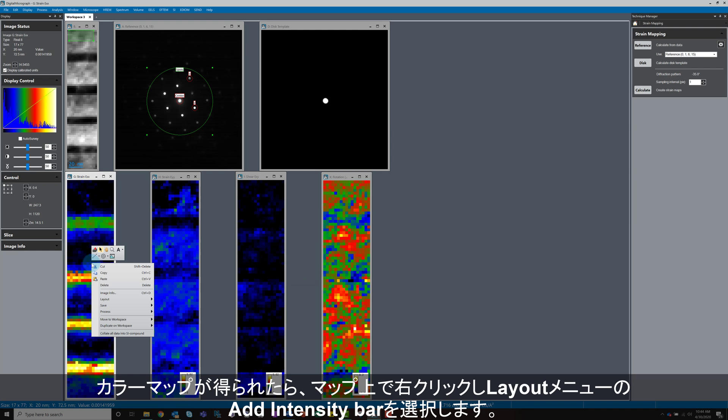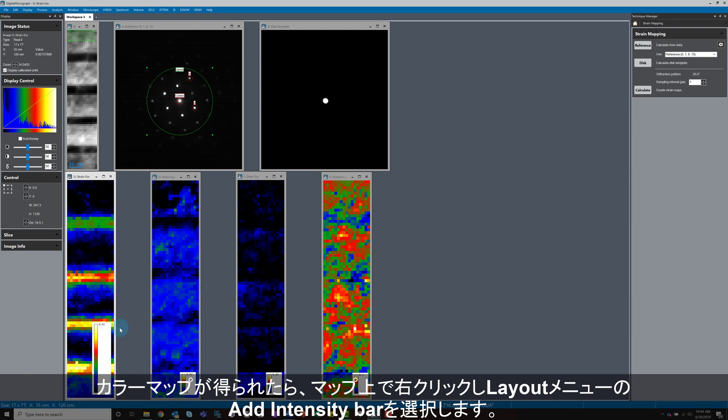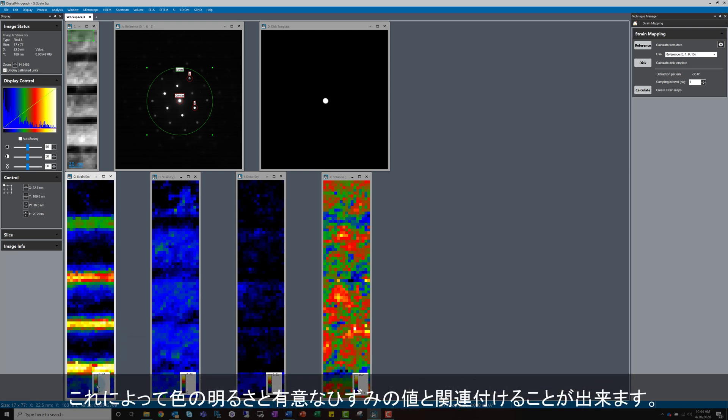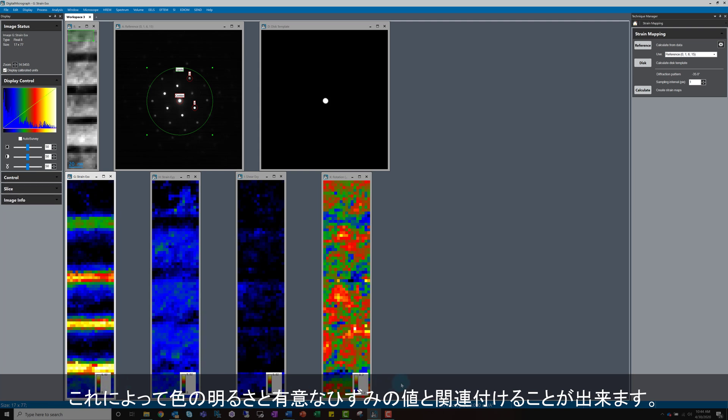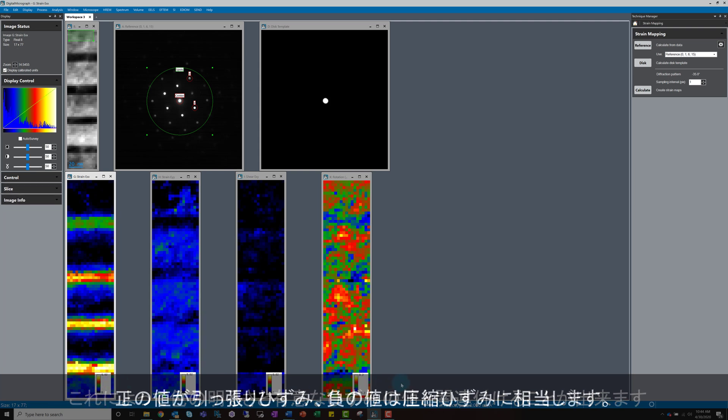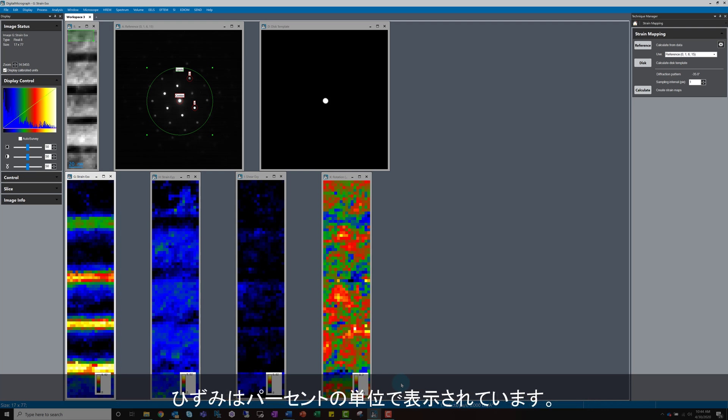Once you have the colour maps, intensity bars can be added by right-clicking, navigating to the layout menu and clicking add intensity bar. This is a useful way to link the colour intensity to a meaningful strain value. Positive values correspond to tensile strain, negative values correspond to compressive strain. Strain is dimensionless, so is usually reported as a percentage.